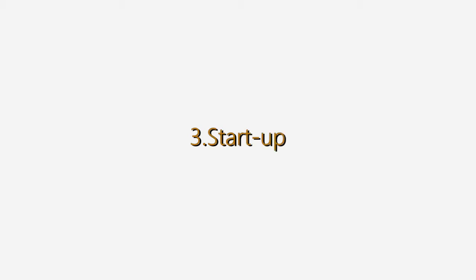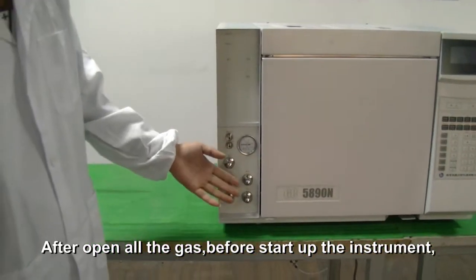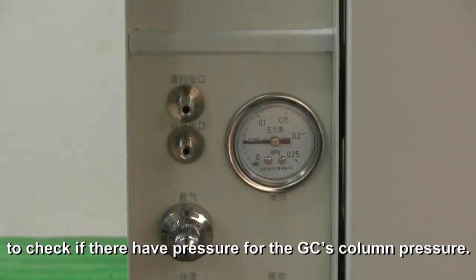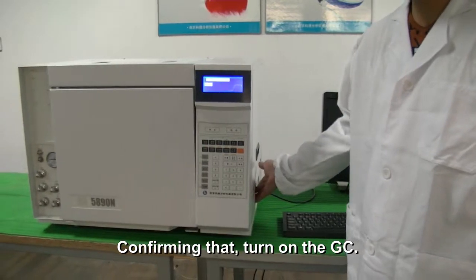Startup: After opening all the gas, before starting up the instrument, observe the front side left pressure gauge to check if there is pressure for the GC's column pressure. After confirming that, turn on the GC.